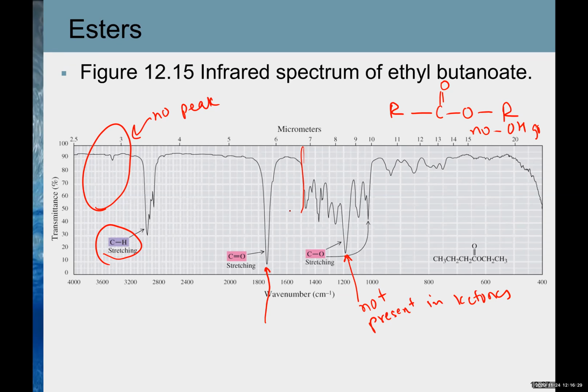In Beyond's lab, we have IR, but I don't think we have testosterone there, but we can pull up a complex molecule and see what the IR spectrum looks like. But there will still be discernible information outside of the fingerprint. Yes, there will be, for sure. Okay, thanks.